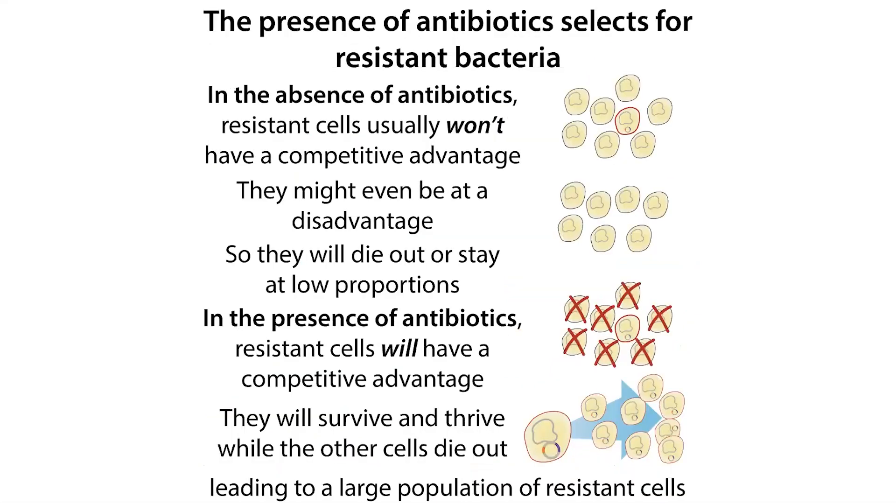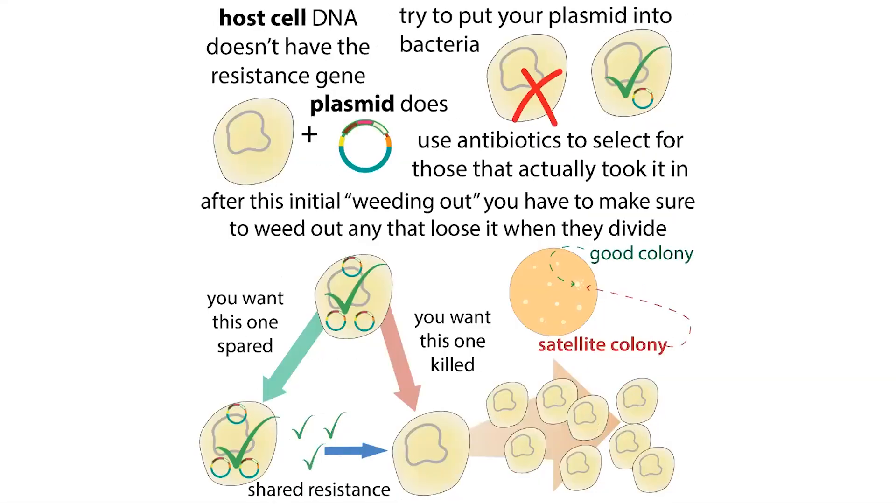So those nearby cells are able to be lazy — they can lose that plasmid, or maybe they never had it. Now they're going to have a growth advantage because they don't have to copy that plasmid or do whatever the plasmid tells them to do. They can survive and thrive thanks to the nearby cell that was doing all the hard work. This means those satellite colonies — those little colonies that don't have the antibiotic resistance gene — are also not going to have whatever else was in the plasmid you wanted them to have, and therefore these cells are not the ones you want to work with.